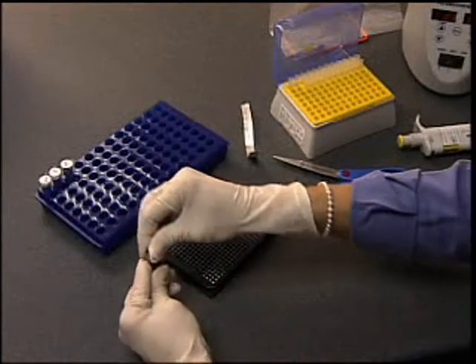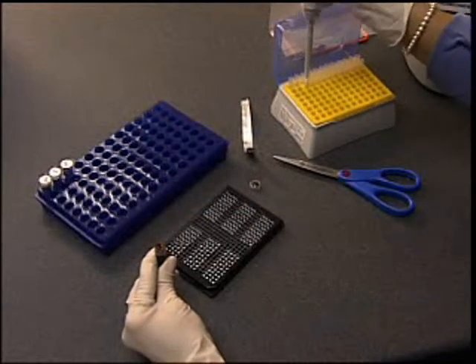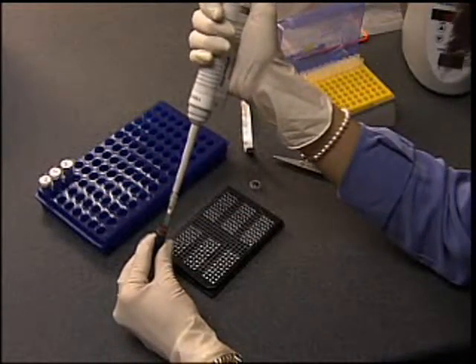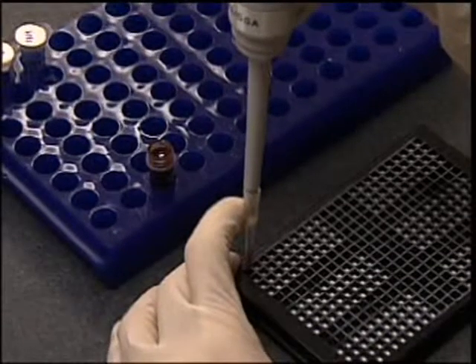Briefly vortex or agitate your blood sample prior to application to ensure that it is fully mixed. In this example we are working with a 2ml blood aliquot, but you may have a vacutainer or other container. In your laboratory it may also be necessary to use blood samples in a biosafety hood.